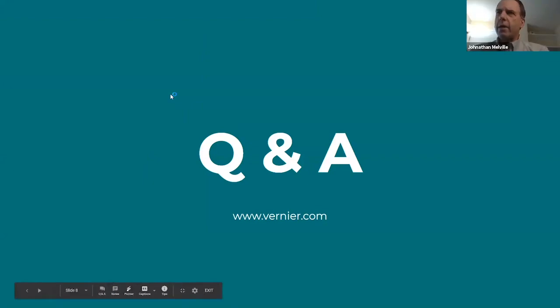I can answer integrating Vernier sensors. The key thing to know is that they only work with the GoDirect sensors. It also only works right now, I believe, Liam or Charlotte, you can tell me, over USB and on PC. But the sample data exists across all instances, even if you're on a Mac. To actually collect data into LT, you need to be using the USB port on the GoDirect sensors, and you need to be using the PC platform.